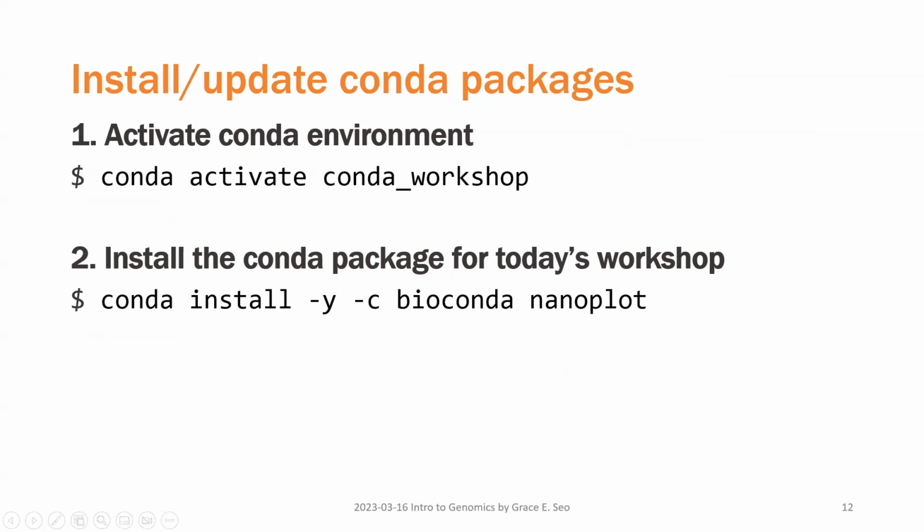Now for this workshop, there are several tools that I asked you, in the last workshop, to maybe try at home and then install. So we will go over the tool packages that we need for today's workshop, like how to install them, and also update the previous packages.